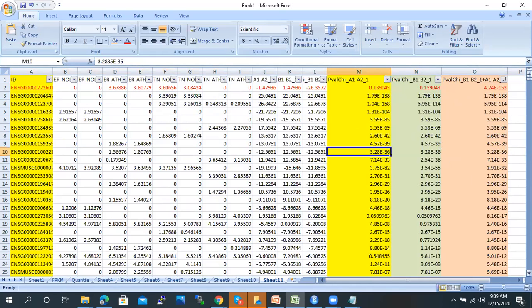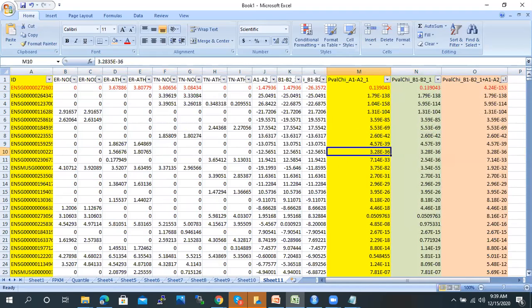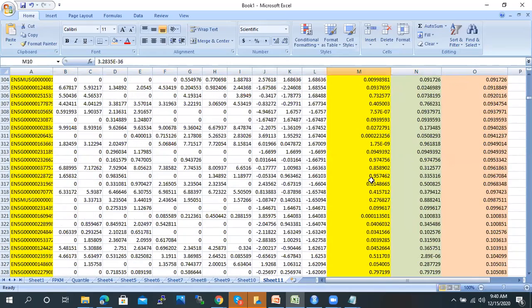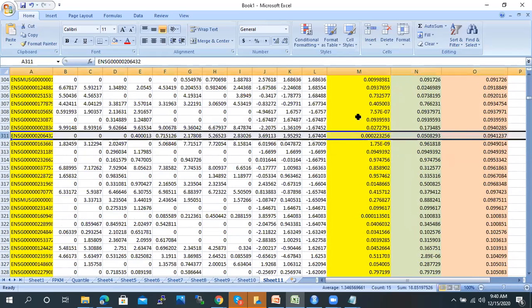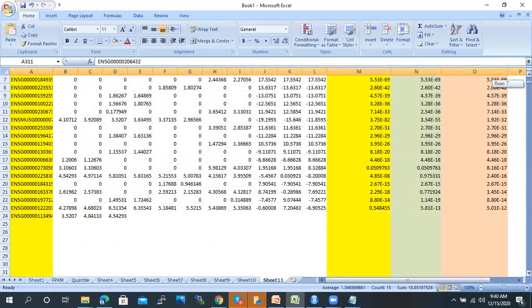So then let's take some genes, like if I'm proceeding, okay, if you look at this particular gene, it is found to be significantly differentially expressed in these two conditions, but not in this. So you can filter out all those genes based on the required condition, that is, found to be significantly differentially expressed in the desired condition.